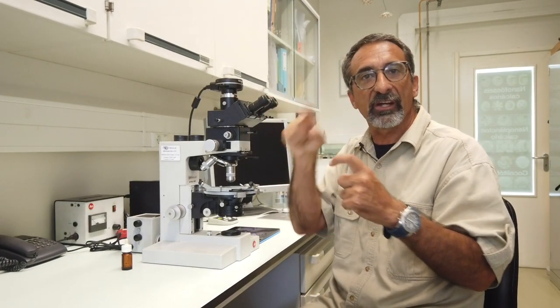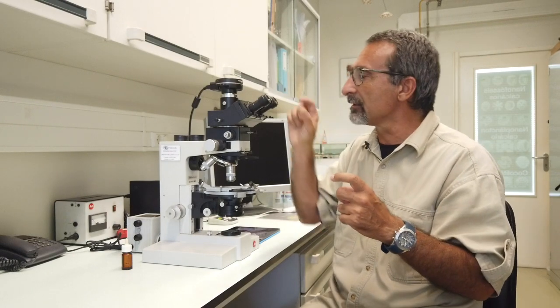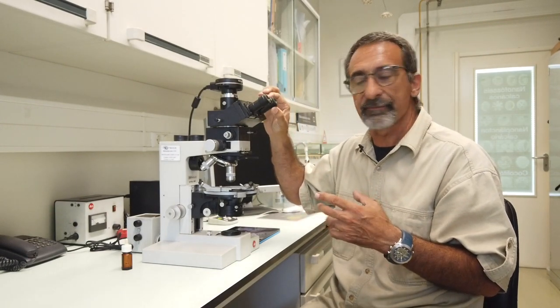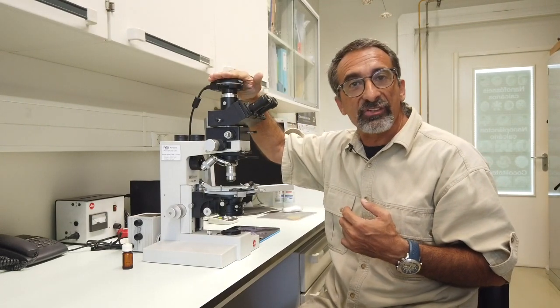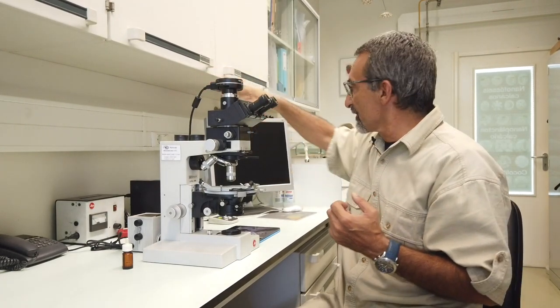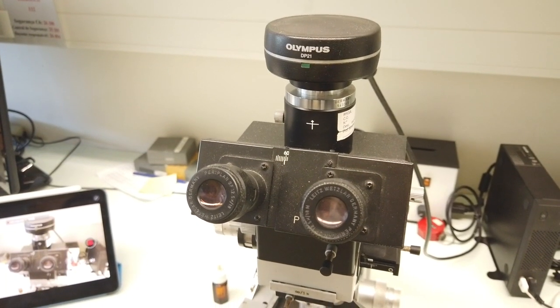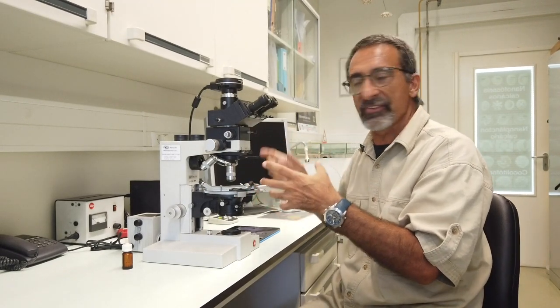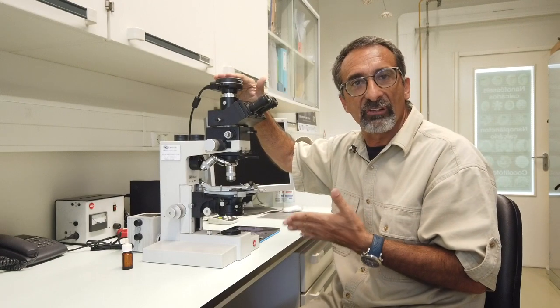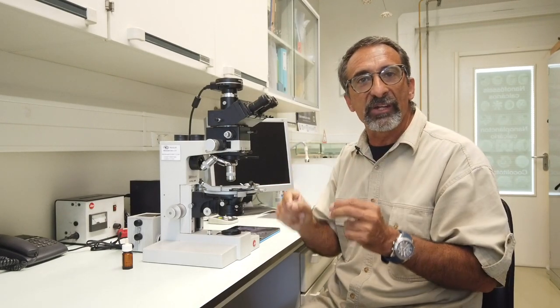It's also useful to have a reticulum, a graduated reticulum in one of the oculars. And then it's also useful to have a triocular with a digital camera to register and record our calcareous nanofossils. Since we cannot collect them and keep them separately, we have to demonstrate their presence through the digital photography in this case. And this is basically all the particularities and all the instruments that the petrographic microscope has.